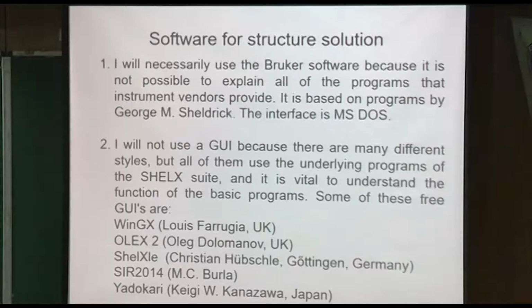Now, I'm most familiar with the Bruker software myself, and it was originally written for computers that had no graphics or anything. They were just lines, and we used MS-DOS. Some of it was even on cards. So these are some of the popular graphical user interfaces. I know that WinGX is popular. Some people have switched to OLEX2. A lot of the people that I really like as crystallographers really like SHELXle. Has any of you ever tried that? All of these are free.